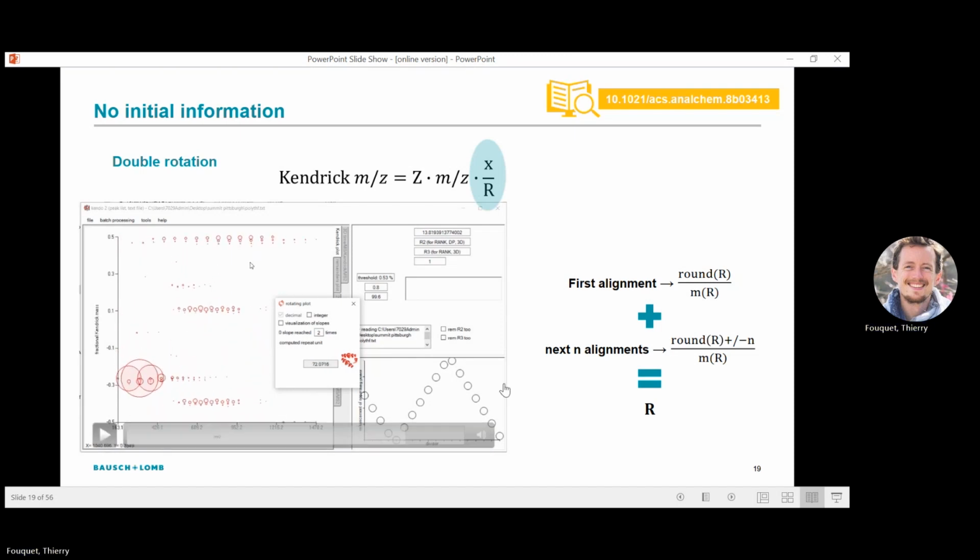Here we are. You have clearly series lining up horizontally, and you can see here that the program has been able to evaluate that mass, 72.0716, which is close enough to the mass of THF.